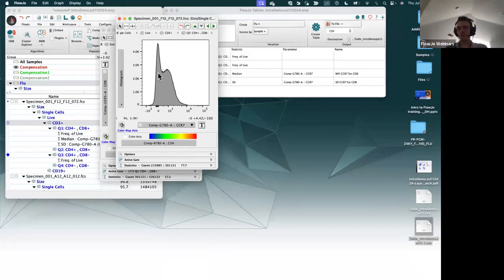So obviously the intensity values up here are very, very big. They have very high values, and they get exponentially bigger the further to the right you go. And so they're going to contribute more. If you use the standard mean, for instance, the right-hand side is going to contribute a lot more than the left. And so in order to balance that, we use a median, which is just the 50th percentile. So it's just the dead center of the data, wherever that is.